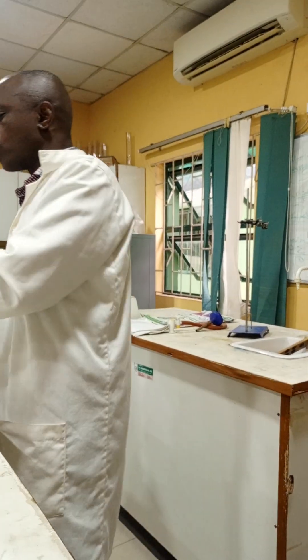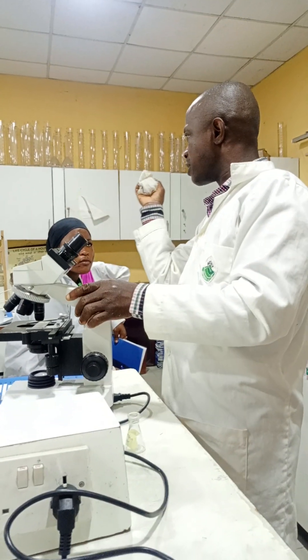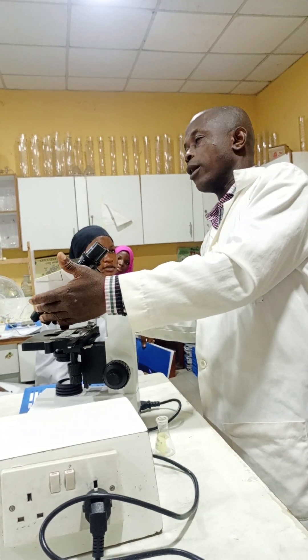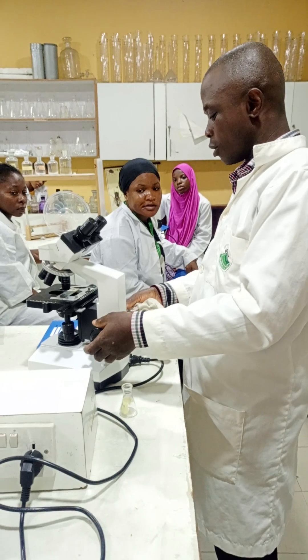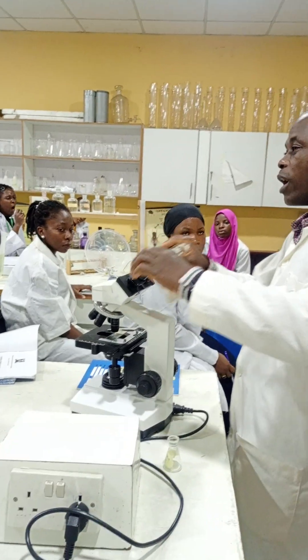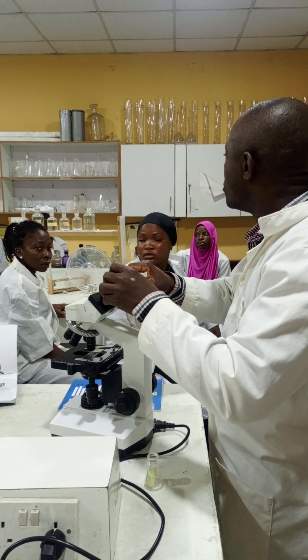In the microscope, we have different parts you should know. We have the eyepiece, the objective lens, the stage, the light source, the coarse adjustment, and the fine adjustment. There are series of lenses inside the microscope that magnify the image.